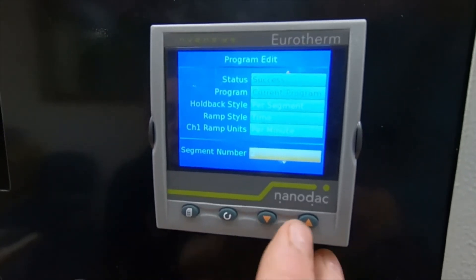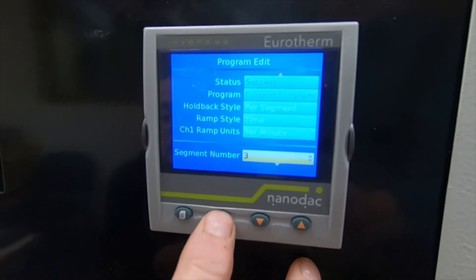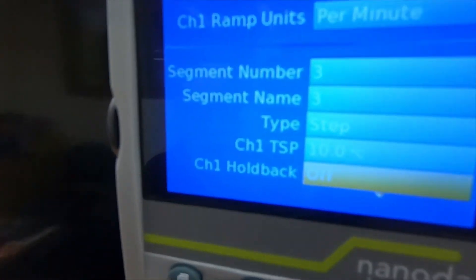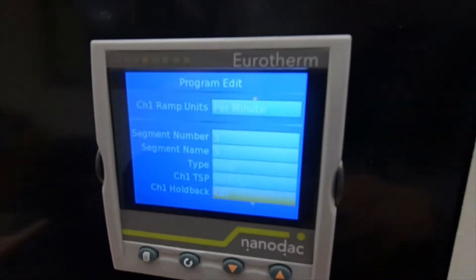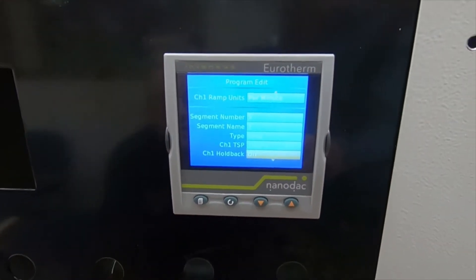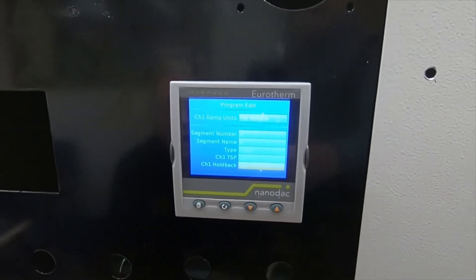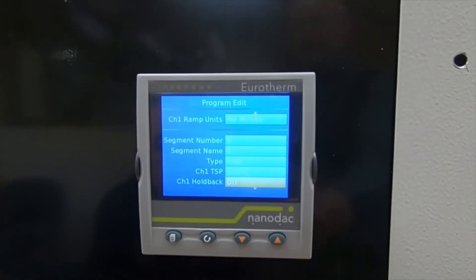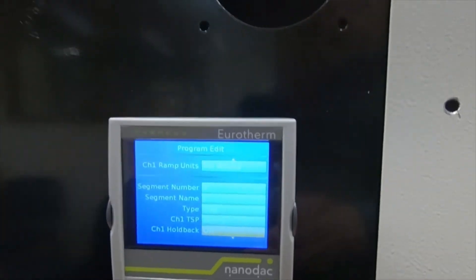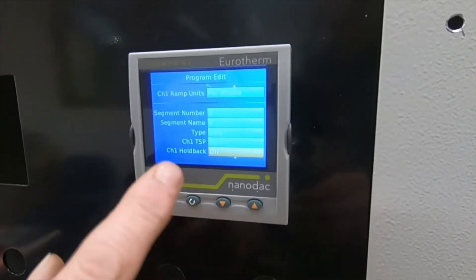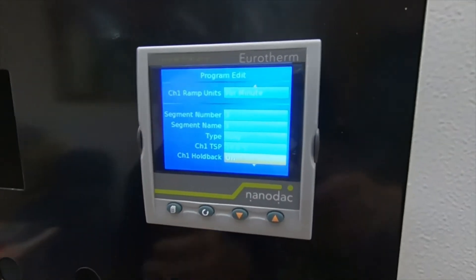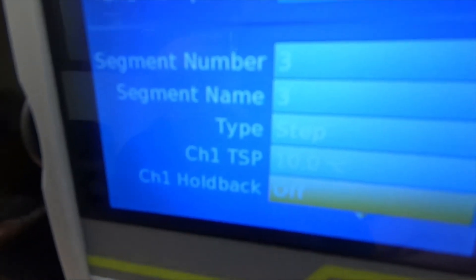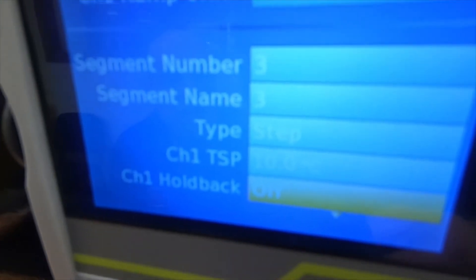Now you're on to segment three. Highlight it with the scroll button, change that to three, and accept with the scroll button. In this case it's a step. The idea of a step — to end the program you put a target set point. In this case we've put 10 degrees. Because of the alarm contacts inside, that will see it as a fault, switch the program off, and that allows the oven to switch off. We've put a target set point of 10 degrees which it can't possibly achieve, and it sees it as an over-temperature and switches the program off. That's how you end your program with a step.